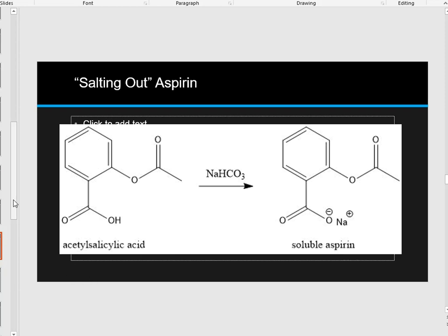All right? In this case, methylene chloride is nonpolar. So when this thing becomes polar, like it is here and over to the right, it's going to fall out of solution and it's going to precipitate on the bottom of the beaker. And that's why it does that.